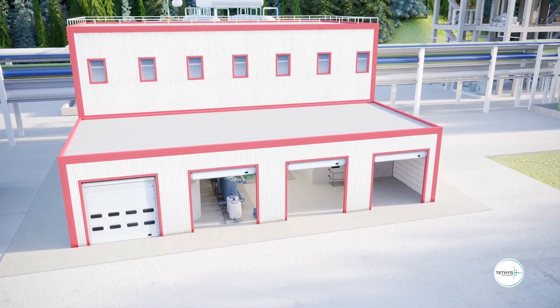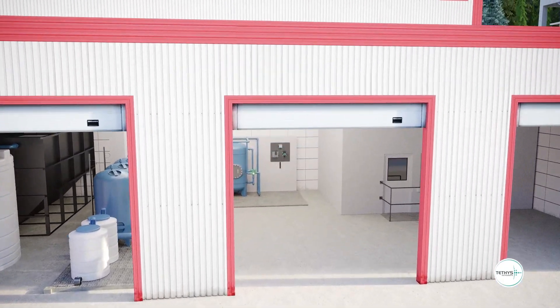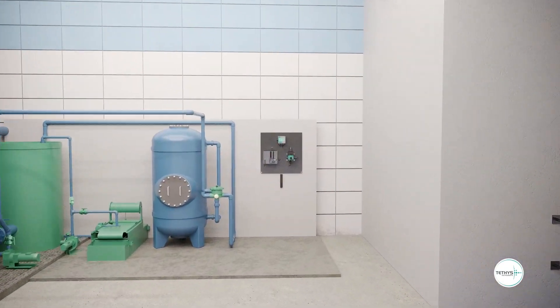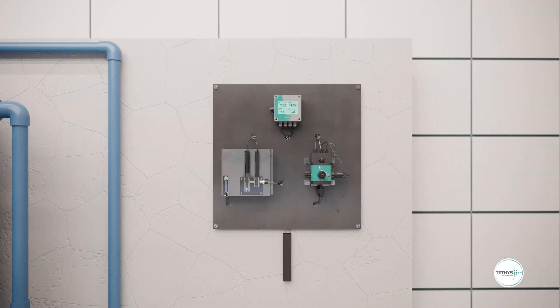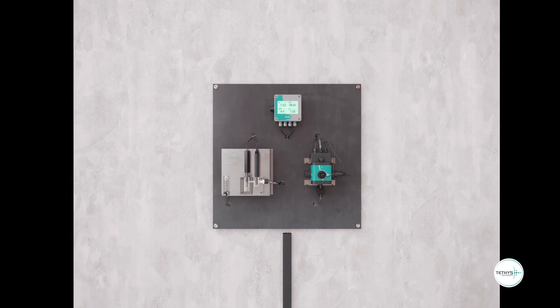The 3-in-1 instrument is composed of one turbidity sensor, one chlorine sensor and one pH sensor that are all connected and linked to the innovative Tethys EL200 water controller for a full control of the water quality.